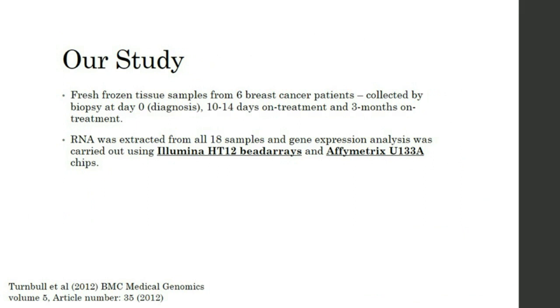Of the tumor at diagnosis, 14 days on that treatment, and at 3 months on that treatment from each of these 6 patients. So we had 18 samples in total, and we profiled these on the Illumina HT12 bead arrays and Affymetrix U133A chips available at the time. Unlike the previous examples, where we were largely using different chips from within the same manufacturer, in this example we're using 2 completely different microarray approaches. And we'll talk about the approaches later.